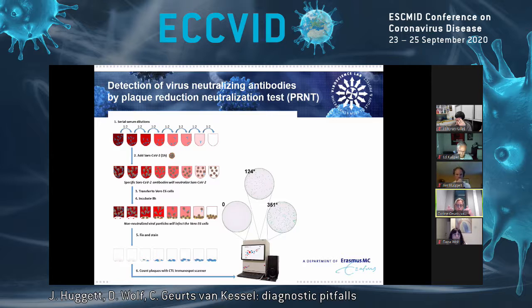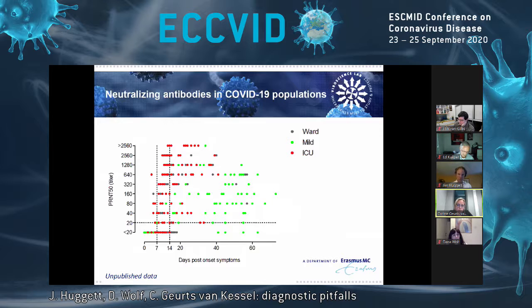And in this way, after 8 hours of incubation in our setting, we can look at how many infected cells there are, which is reflected by the amount of plaques in the cell layer. You then get a titer, which corresponds to the amount of plaques. So this is an assay which we have used a lot to look into the immunity.